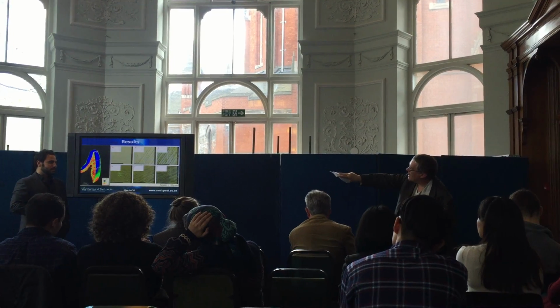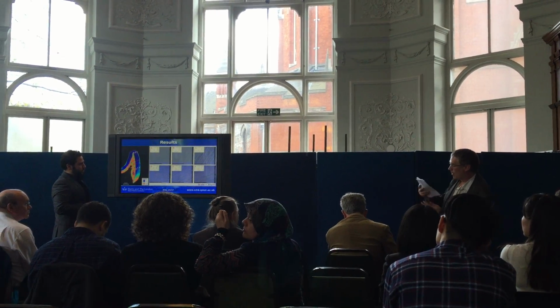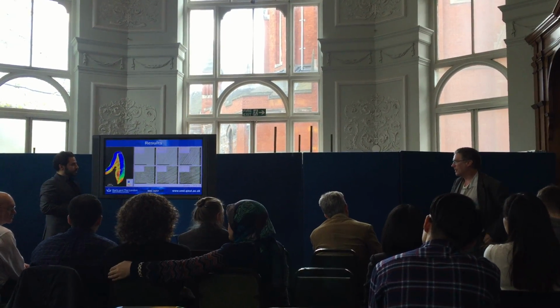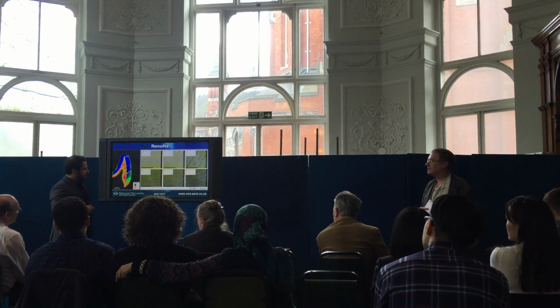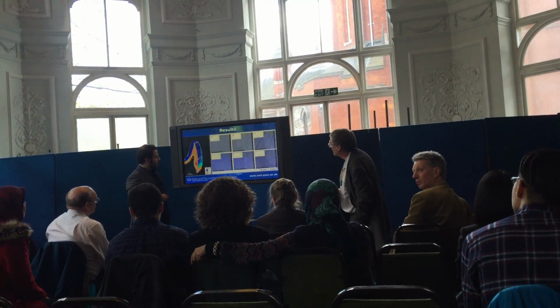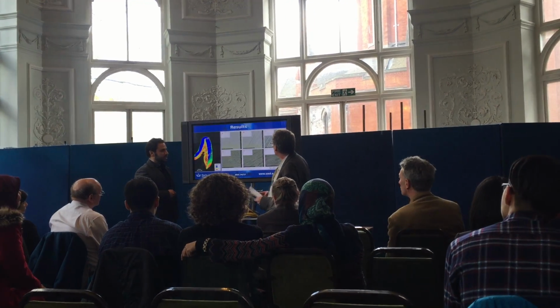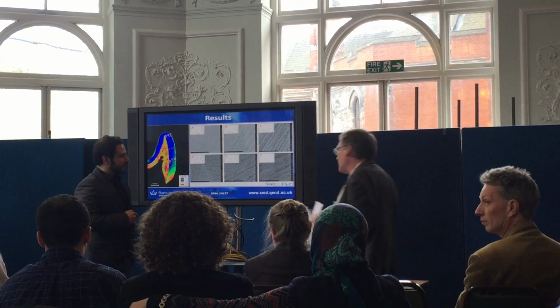Maybe you've got more defined prism boundaries there, a greater change of angle in the crystallites within the prism. Yeah. But as you can see here, this is 30 micron. So what we probe in an S-XRD is not the interprism. We're probing shapes here.